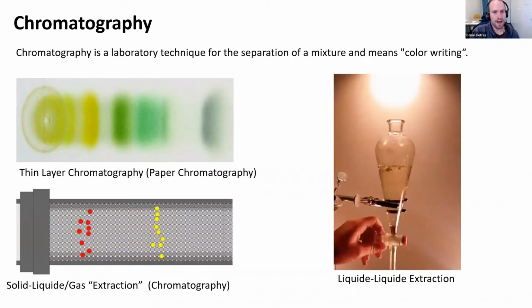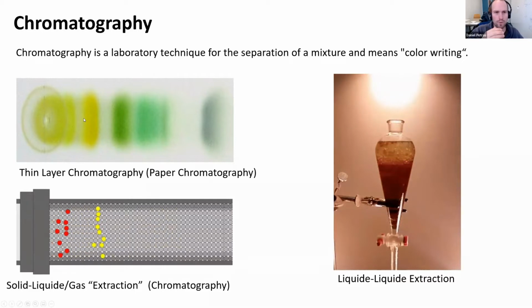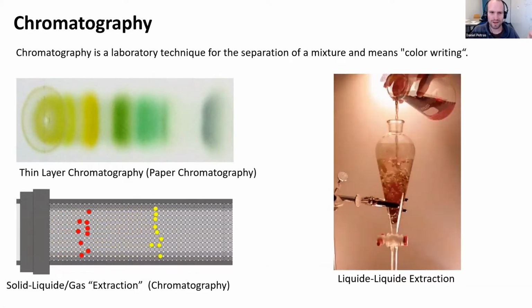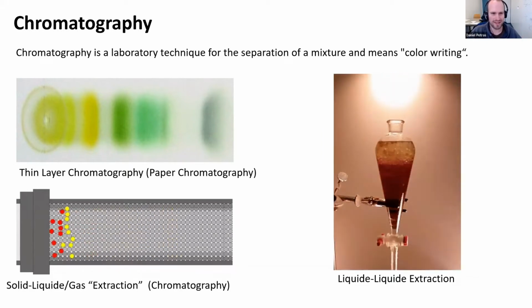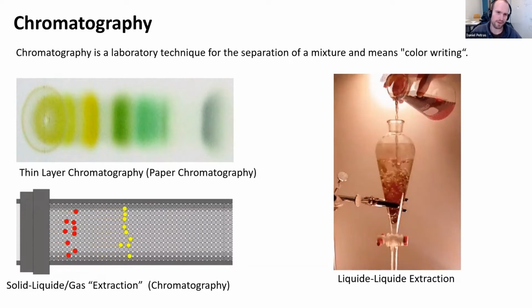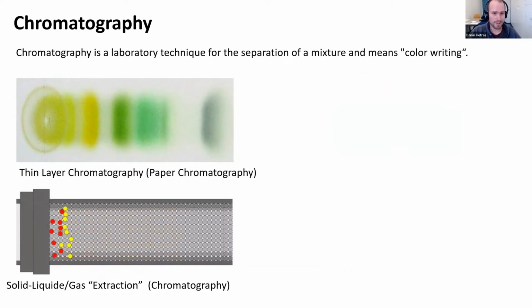And hence, for example in paper chromatography, they move differently, fast or slow, or in column chromatography, where it's pretty much the same principle, you would elute them at a different time out of the column. And this is exactly the principle of UHPLC or HPLC, for example.